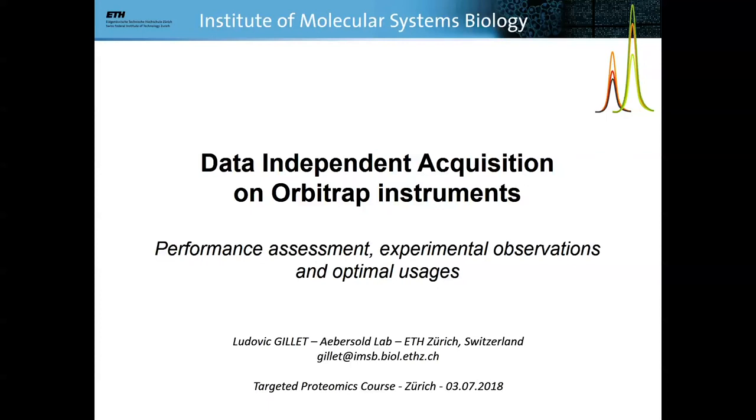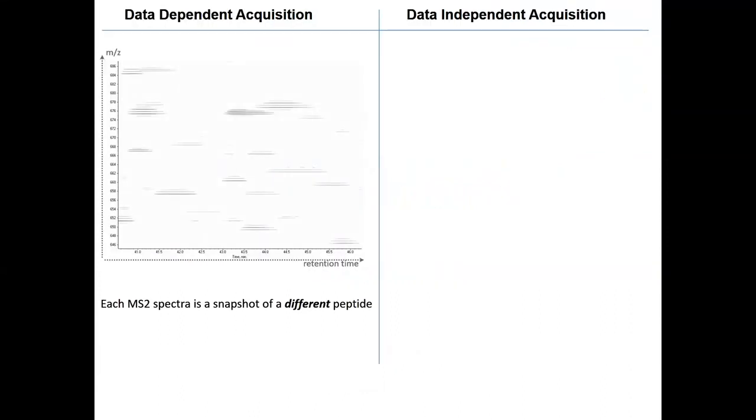Yeah, so for people, I've been establishing and working mostly with Q-TOF, TripleTOF data. So I'm relatively new to the Orbitrap DIA field. I will try to share with you some observations we have made in the last couple of months using this data. It comes partially from a QExactive. You will see some data is from QExactive, some data is from our Lumos that we got a few months ago.